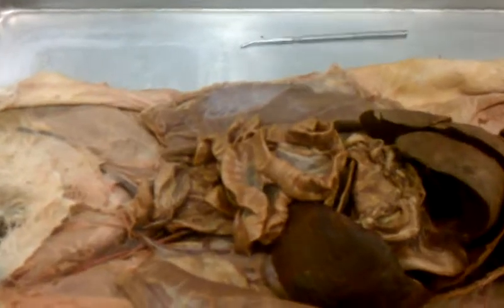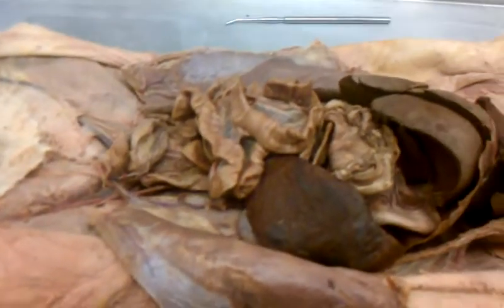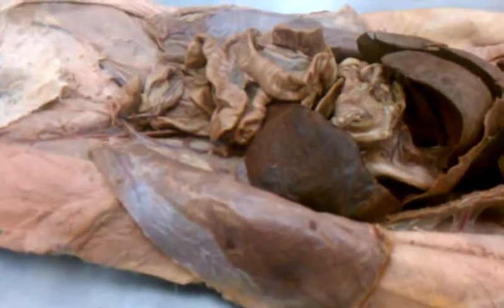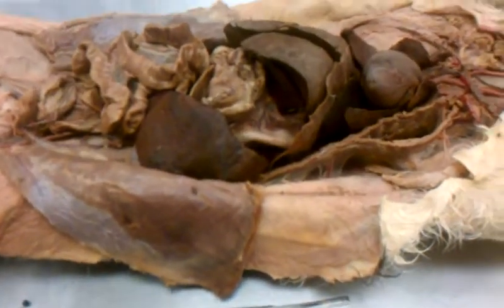Okay, digestive tube or alimentary canal or gastrointestinal tract. I would definitely know the name of that. If I gave you the components and asked you what canal or tract or tube this is in, be able to label it. Yes, so you need to know all of them or just know one of them? No, just be able to label them. Oh wait, just label these? Know the overall heading, and then you have to be able to point those out.